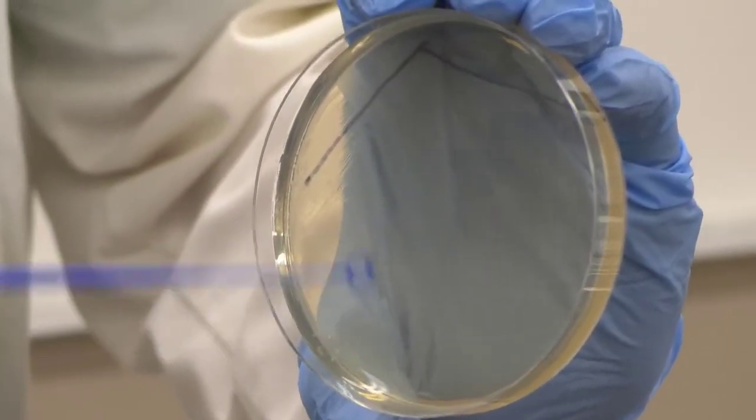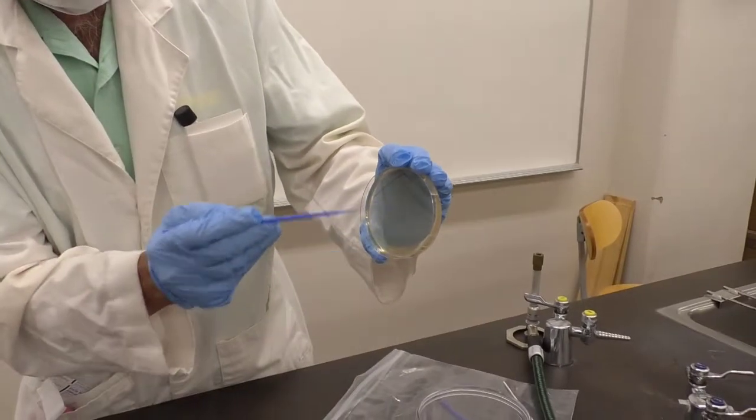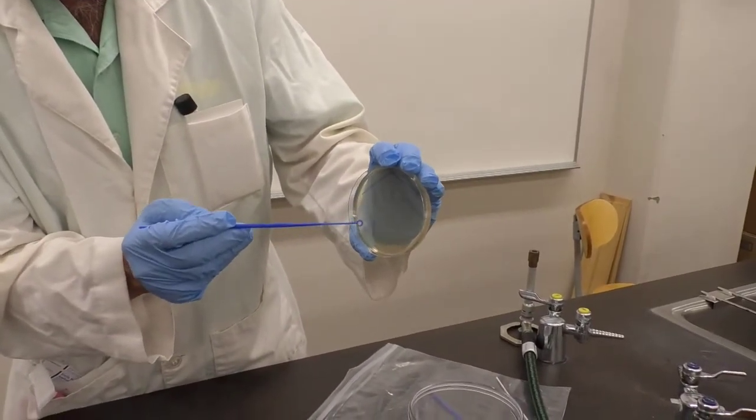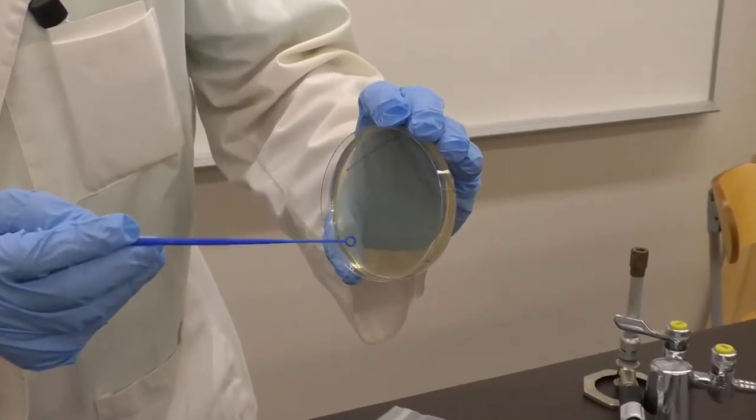Some people might do a fourth but I think a third is going to work. Take advantage of the whole surface of the agar plate. The idea would be to get individual bacteria out of this open area on the plate that will form a colony.